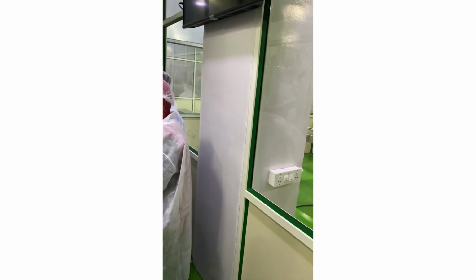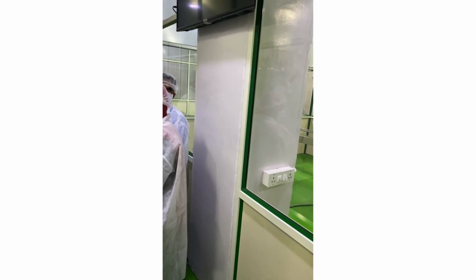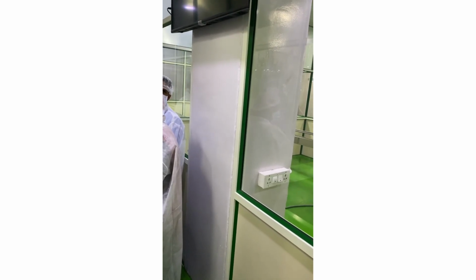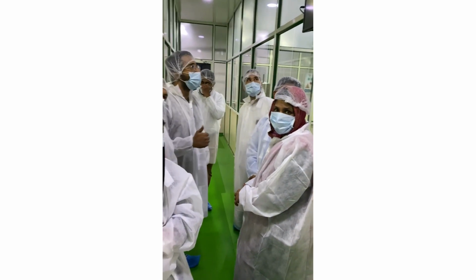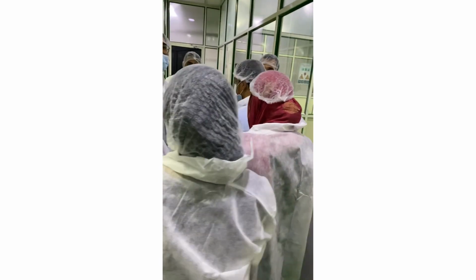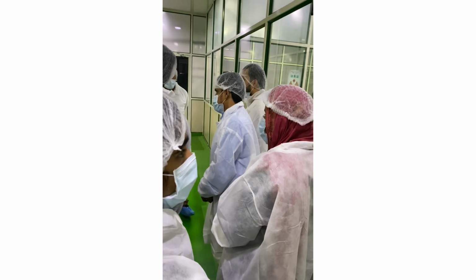Once it starts running, it is displayed for all our operators also, to ensure all SOPs are followed. It will be displayed here every time: what batch is running, what product is running. Standard Operating Procedures, all SOPs will be displayed here.